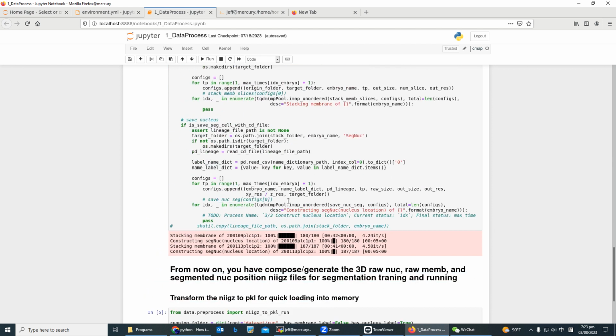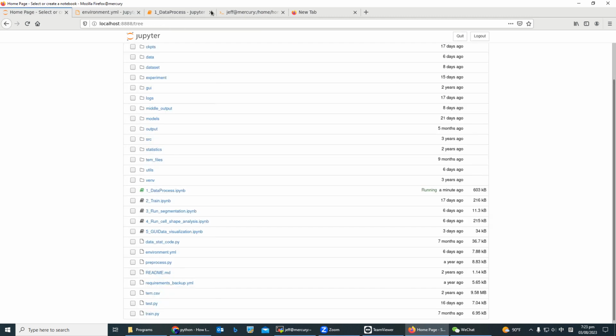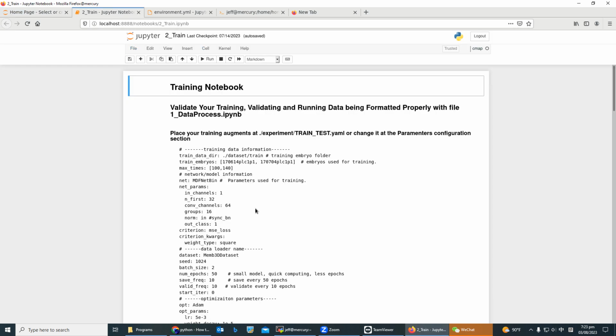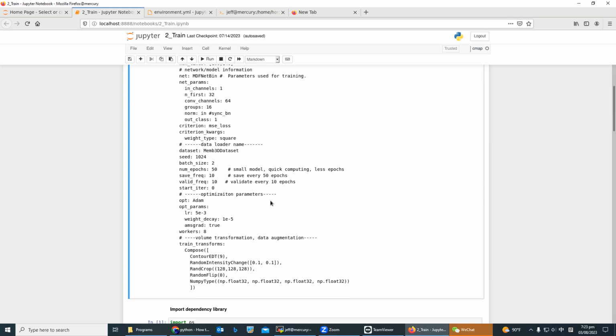And let's go down, and I think it's very clear for you by reading this explanation. So let's go to the training part. Let's stop it if we don't use it. Yes, and here's the training part.